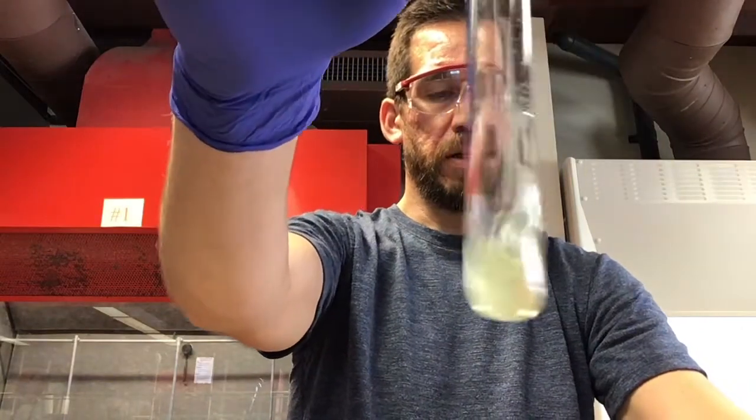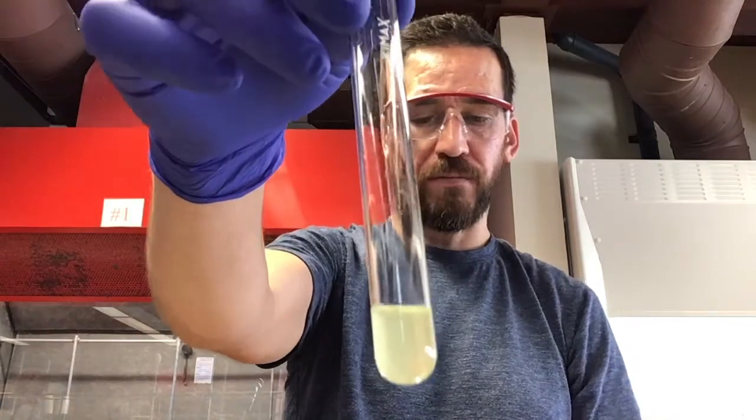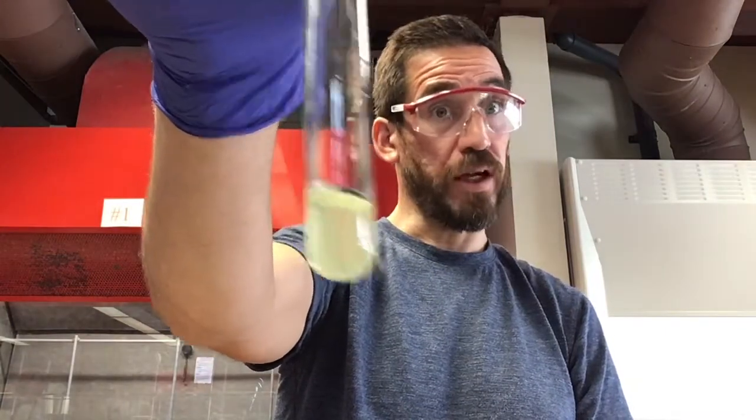Oop. So this one is a little cloudy. That's the bromine one. I'm sorry, that's number 4, 1-bromobutane. That is looking cloudy, right? Not sure about that one. Okay, so let's see here. What we've got is number 6, and this is crotyl chloride.